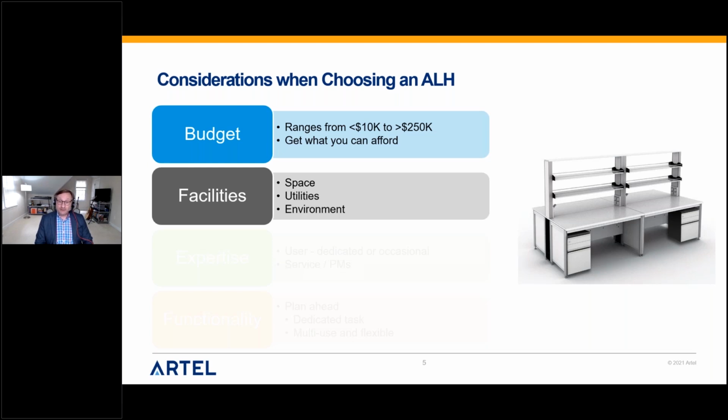It's utilities, I think, that is really the big issue that a lot of times people overlook. They're always in the site setup documents, but a lot of times people think you can just plug these in. But many times a fully automated system requires air or nitrogen. It might require vacuum. It might require a couple of power sources. And then you have to think about the computer, where's that going to go? So it's not just space, it's about the actual utilities. And I've been in so many times where I've had a piece of equipment brought in, and there's a lot of power utilities work going on once it's installed or once it's set up.